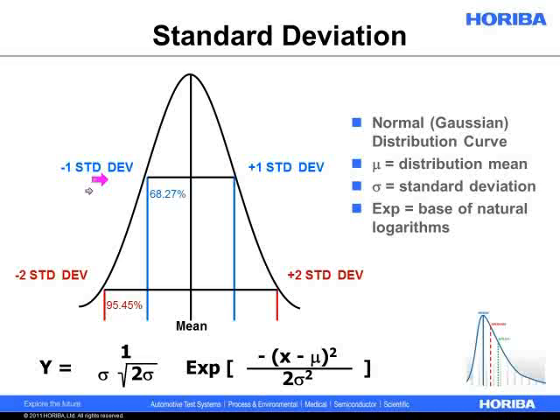And if you're not familiar with what the standard deviation is, just know that it's a way of moving some certain distance away from a central value. I'm not going to get too in-depth. You know, the Wikipedia page, I'm sure, is excellent at describing standard deviation. Just know that one standard deviation for a Gaussian distribution accounts for 68.27% of the width of the distribution. 2 standard deviations is 95.45%, and then it just gets wider and wider as we move more and more standard deviations away from the center.